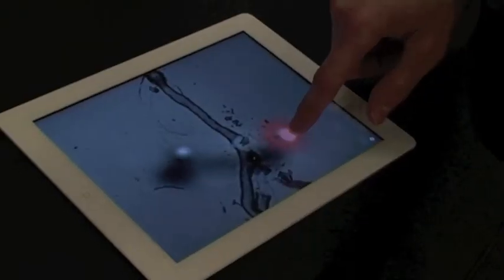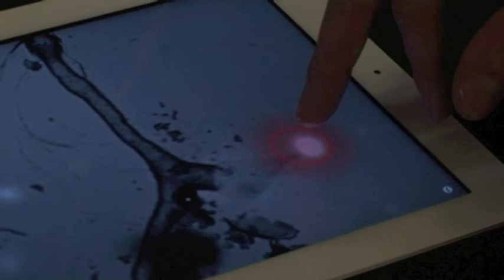The idea is that by having several such needles we can create junctions and we can build up complicated chips from a simple starter kit. Our hope is that this will make microplumbing as easy as finger painting.